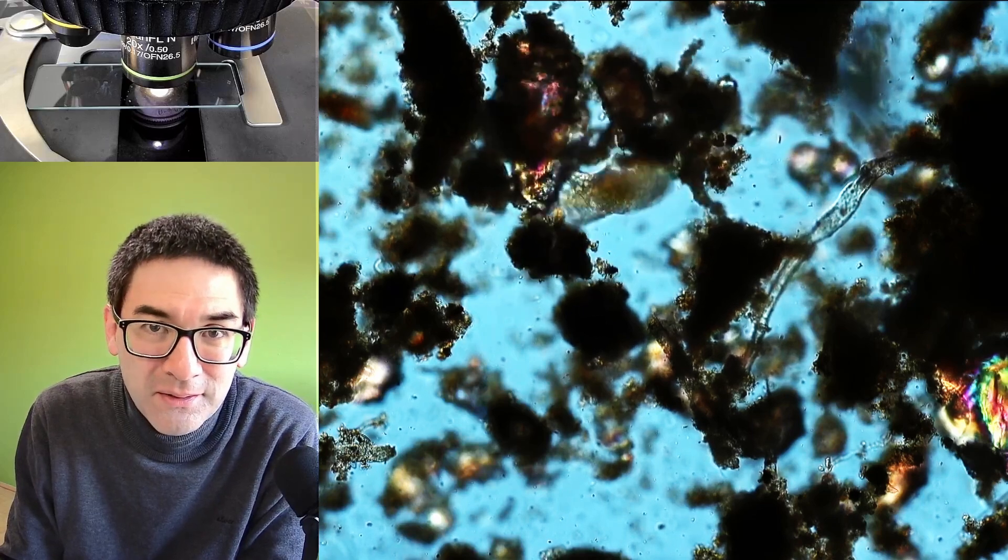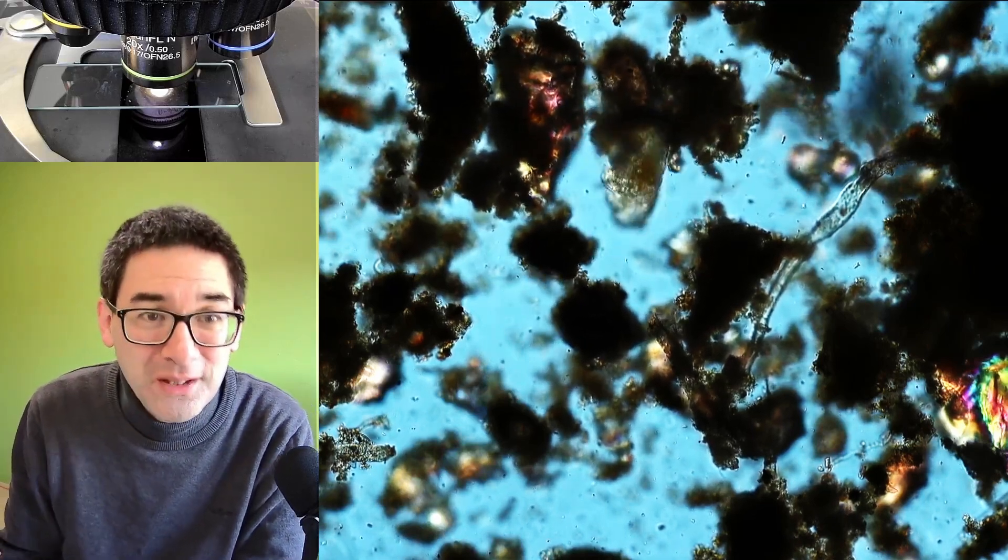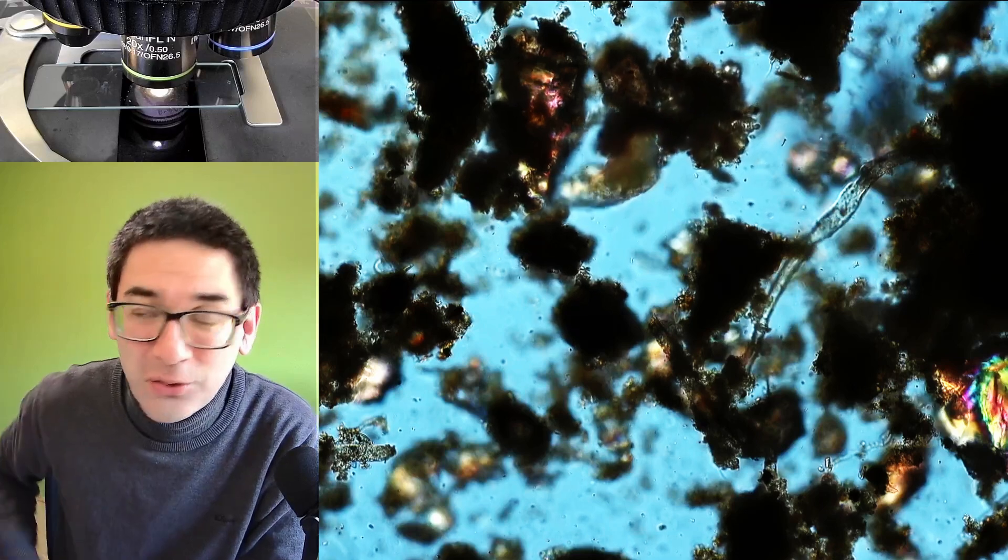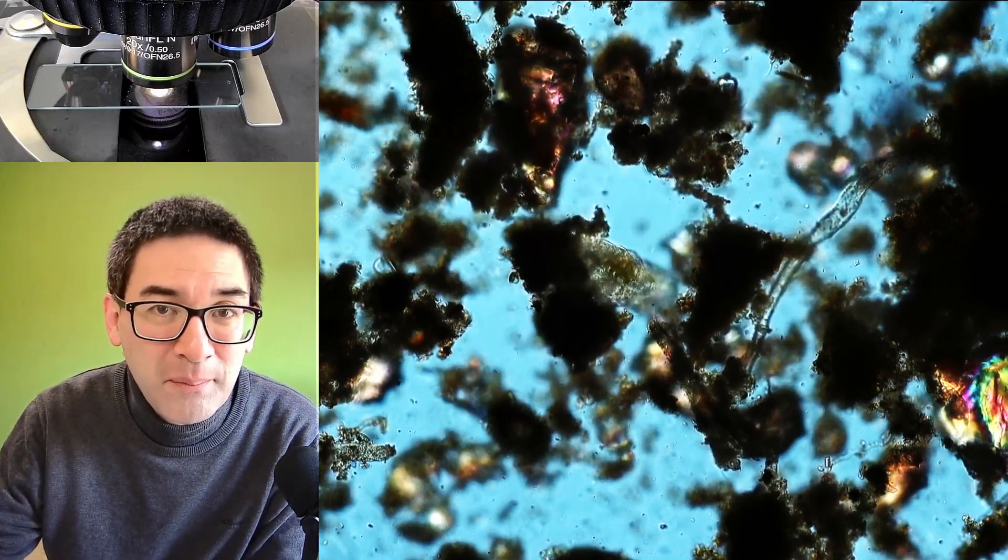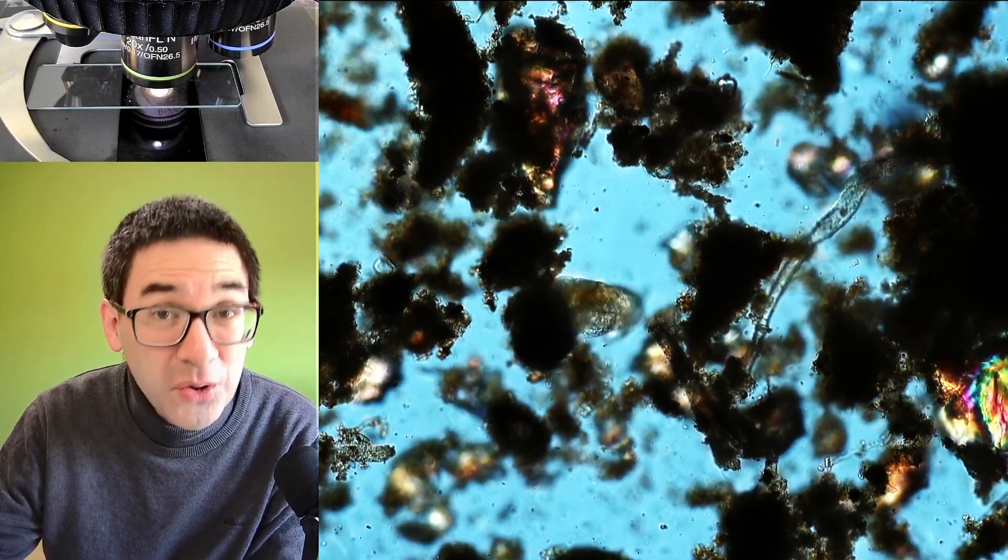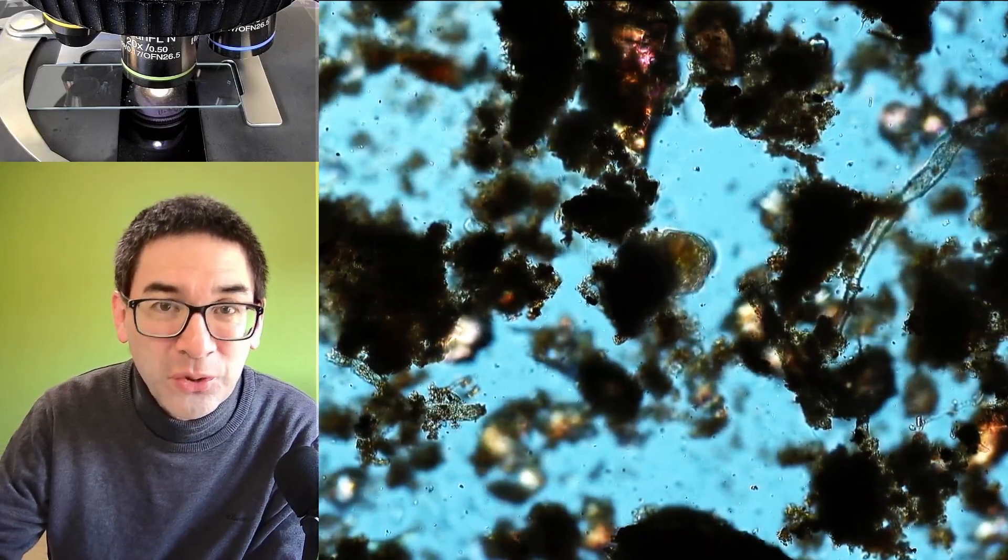But in any case I'm kind of happy to be able to report back that yes this moss sample does also contain tardigrades which is not always the case because I've already seen some moss samples where there were quite a few of them, lots of them, and then some others I was not able to find anything at all. But look here we've actually got one.